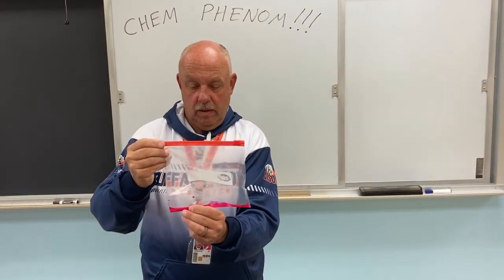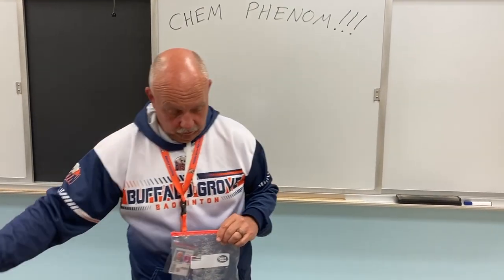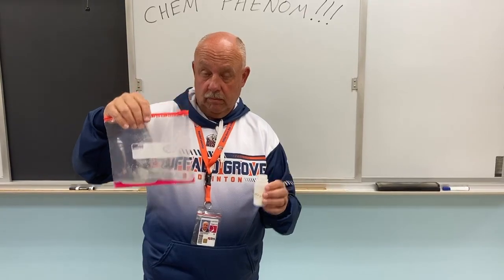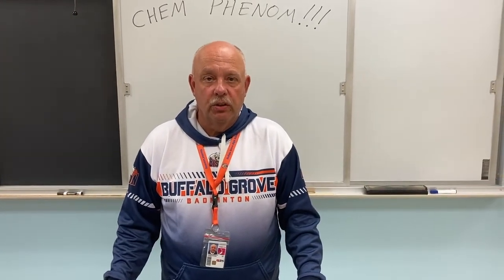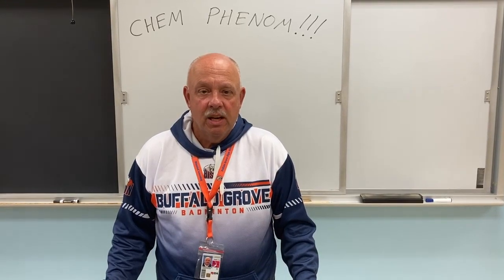If we're gonna summarize this last part, when we put the calcium chloride with phenol red, it got warmer. That was about it. And when we put the sodium bicarbonate in with water and phenol red, it got colder. Yep. Okay. Thank you. All right, fill out your data table, and then we'll see if we can make some observations and inferences of what's going on there.